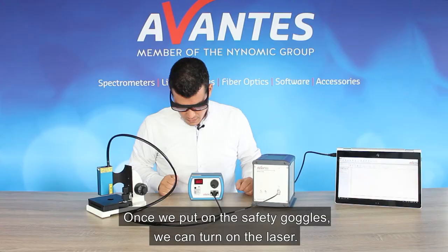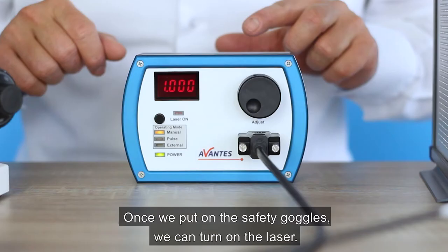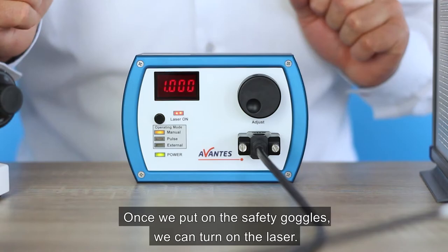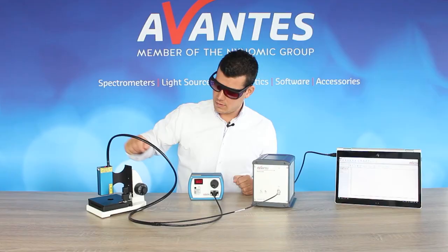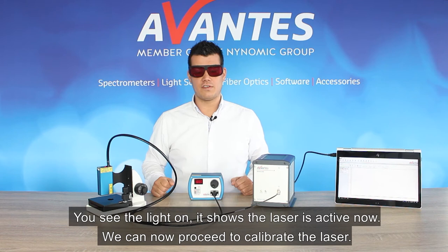Once we put on the safety goggles, we can turn on the laser. You see the light on it shows the laser is active now. We can now proceed to calibrate the laser.